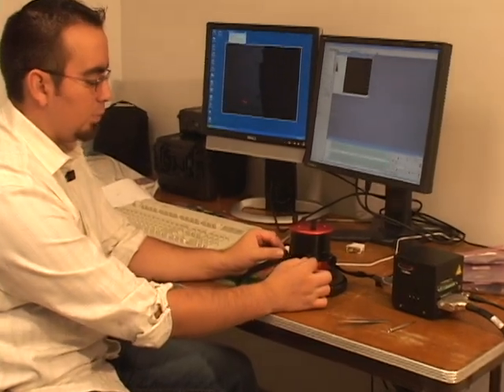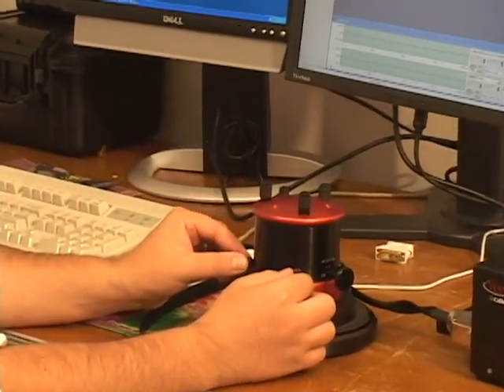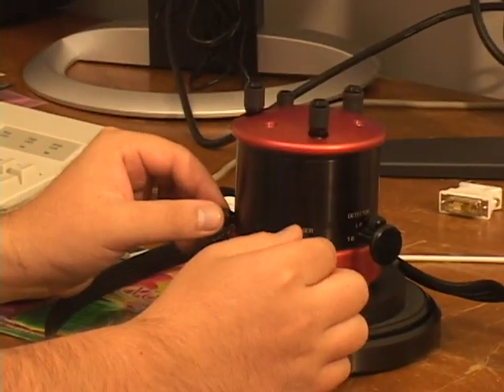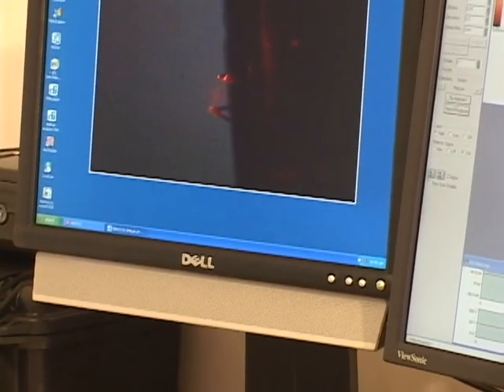So you push those 2 in. Sort of bring it to the probe. After you've moved the laser onto the probe, pull out both knobs. It's kind of like to disengage them.